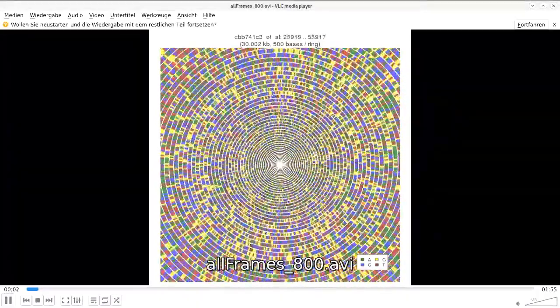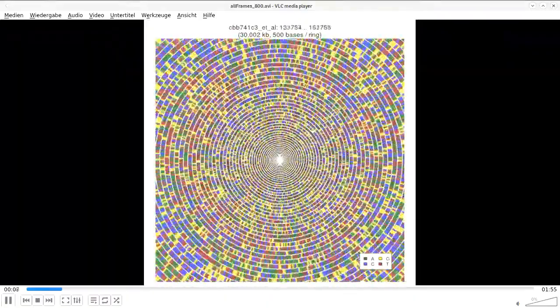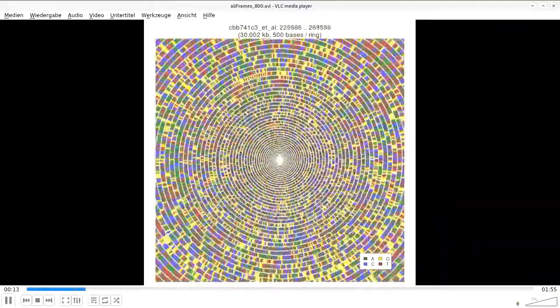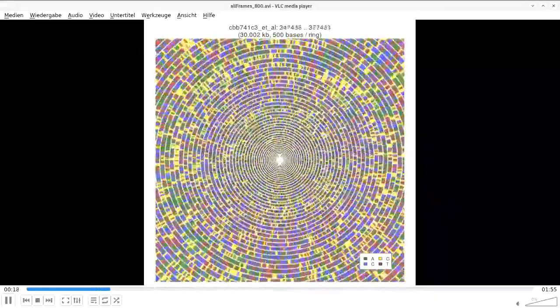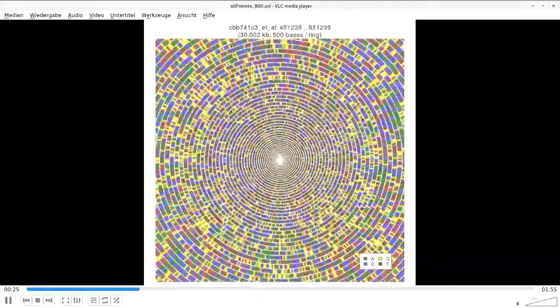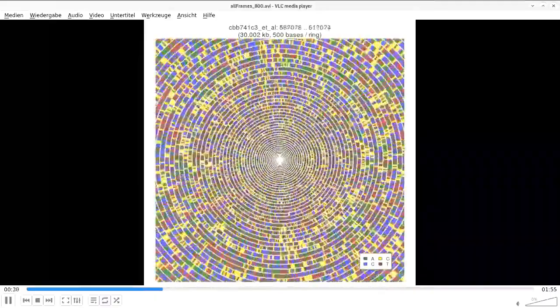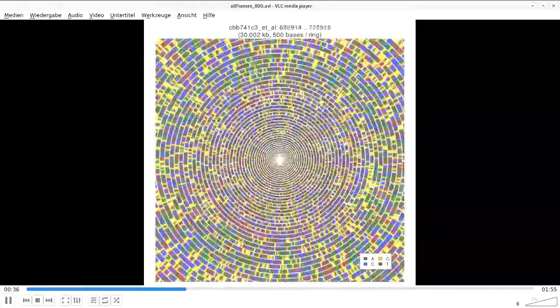This is the longest DNA sequence that's ever been sequenced on one of these MinION devices. This is a DNA sequence that is 2.3 million bases long, and you're seeing a run through the entire sequence. We're probably not going to get to the end before the flow cell has finished doing its thing. But the point is, there's lots of DNA there, and it takes a long time to get through.